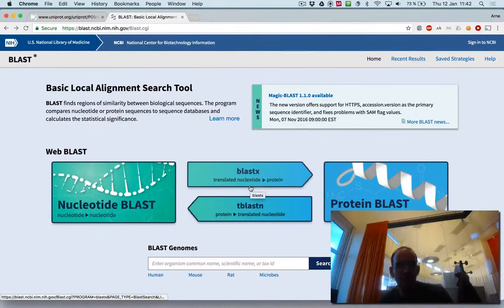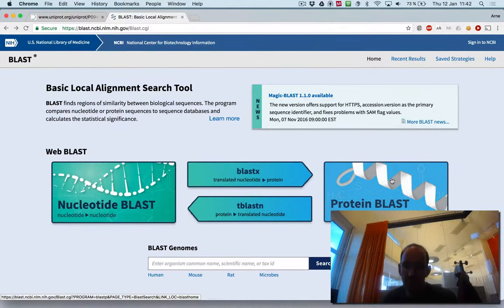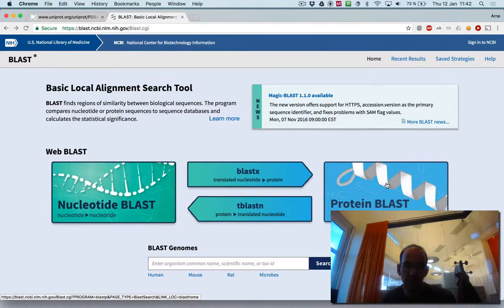Now I will demonstrate how to run BLAST on the web. The first thing I will use is the NCBI BLAST tool.